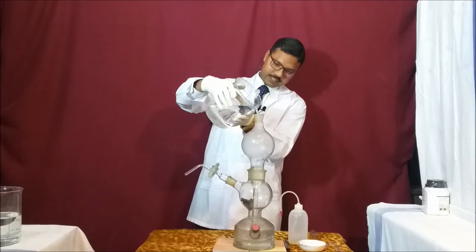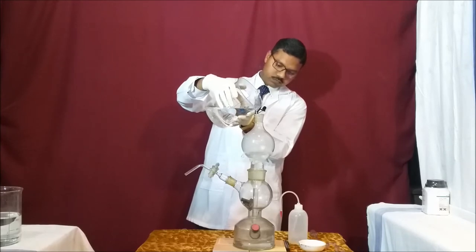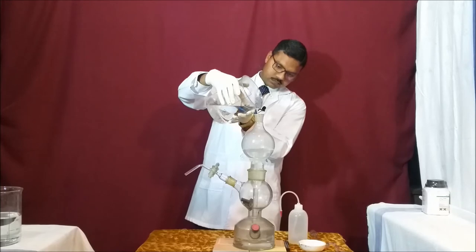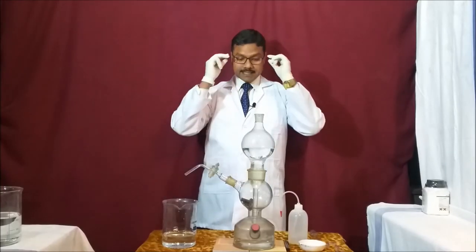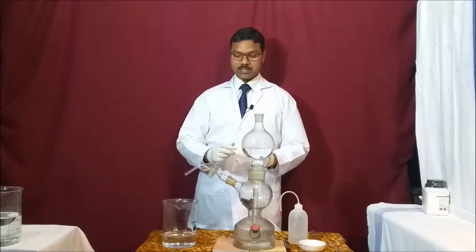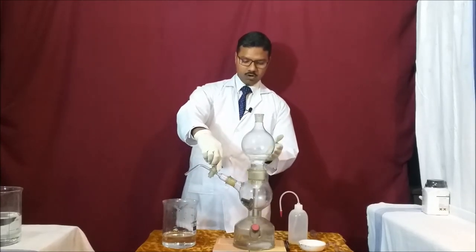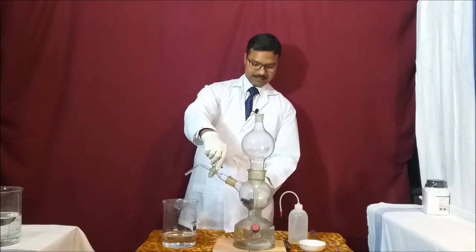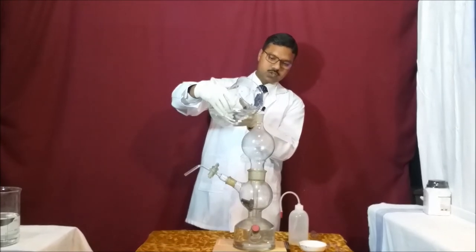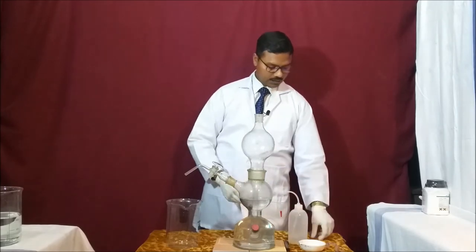The acid is going in — always wear gloves and specs. As I introduce the acid, it gets stuck in this chamber and does not go down because of air pressure. As soon as I release the knob, the air present here goes out and all the acid starts going inside. In the same manner we fill all the acid. Now our big middle flask is filled.